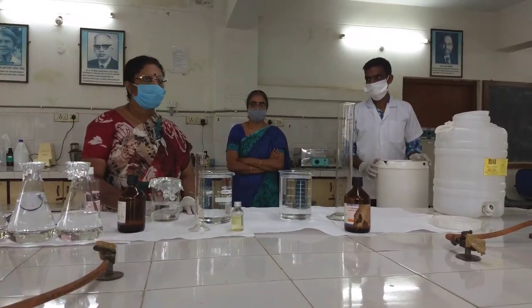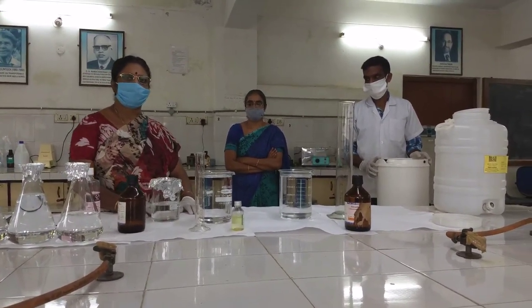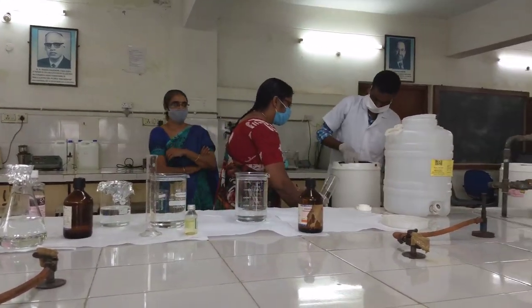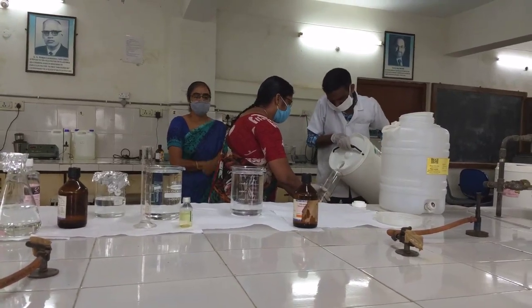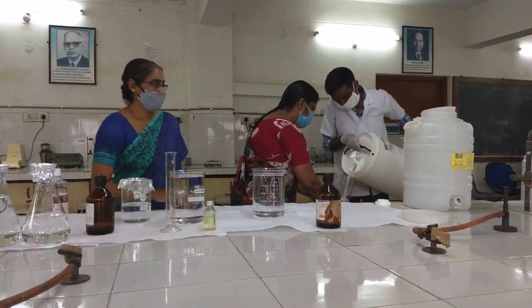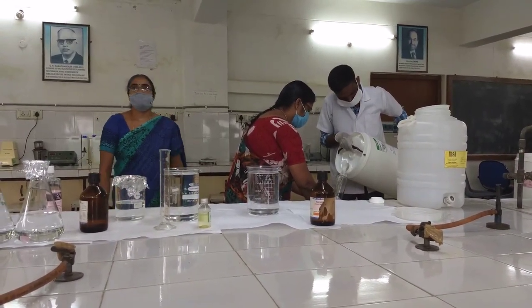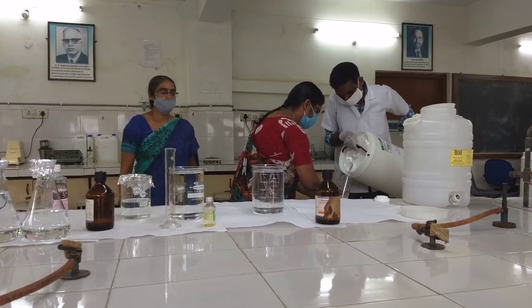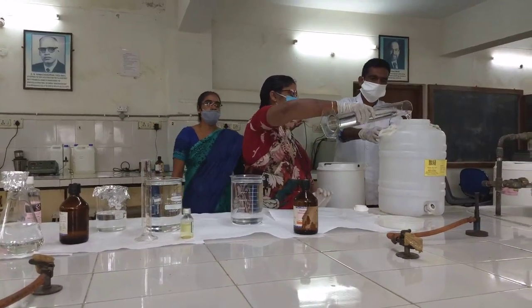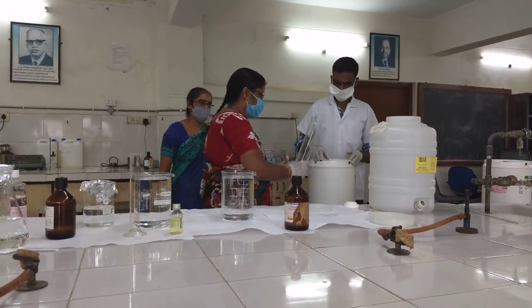Now we are going to take 7.5 liters of isopropanol for the first step of preparation of the sanitizer. Already 2 liters and 2 liters have been taken in the containers and we are taking some more isopropanol because we require 7.5 liters total — so far we have taken only 4 liters. We are now dispensing 1 liter of isopropanol into the container which is ready for preparing the hand sanitizer.